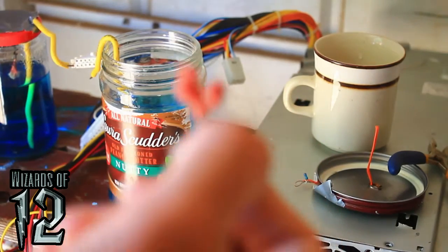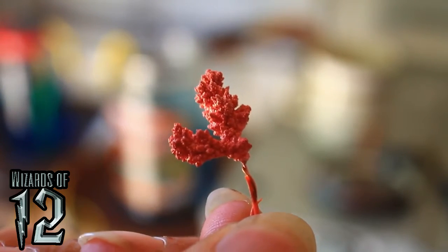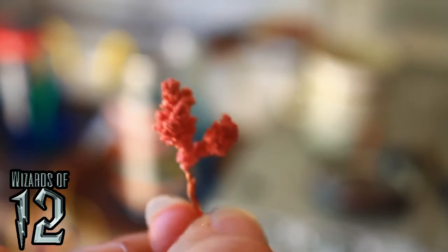Let me bring this close to the camera — very interesting. This is copper.